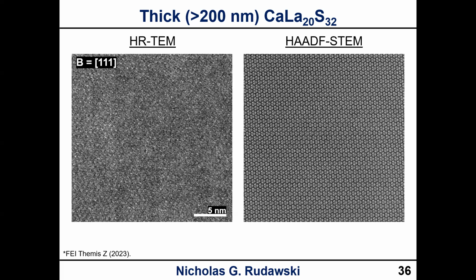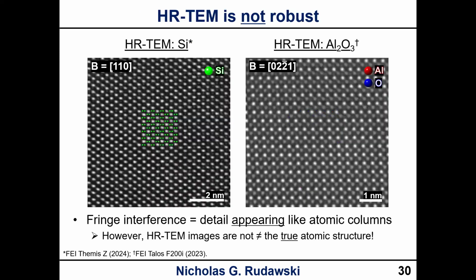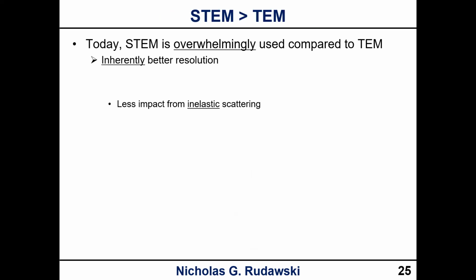Okay. Well, a separate, unrelated question from Qingtao Ku to everyone: STEM has a shallow focus depth, and if we change the focus, why does the STEM image get blurred instead of focusing on another atomic layer? In a normal atomic SrTiO3 HAADF image, are the atoms in the image on the top surface of the specimen? Okay, that's a really good point to mention. So if I go back here, this is really a question about depth of field.